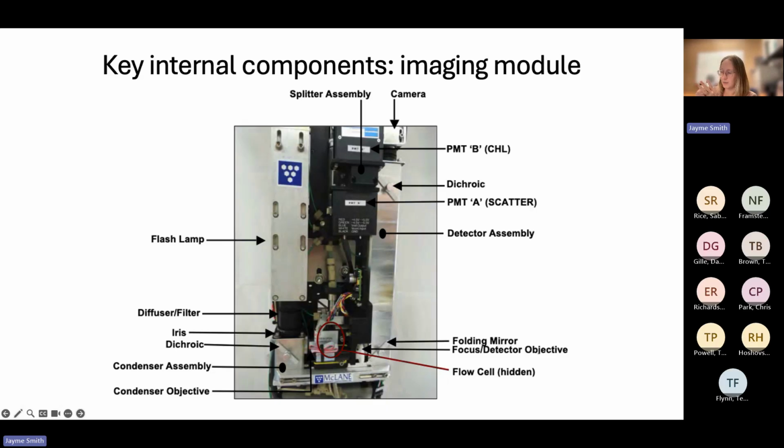It operates a lot like a microscope, where you align the iris. You have a filter and a diffuser that you align, your condenser and your objective. So when you do any maintenance, a lot of it is alignment, and that can be a lot to get the instrument all aligned and everything in line so you can capture images that are suitable for identification down the road.